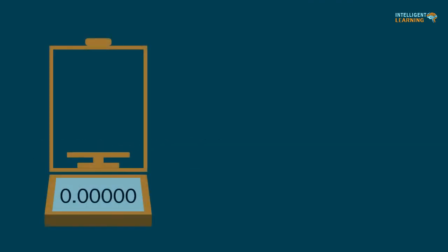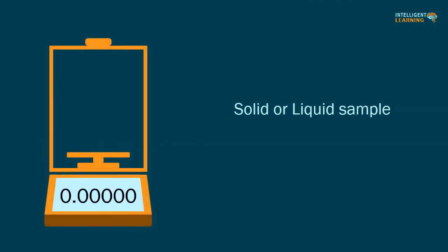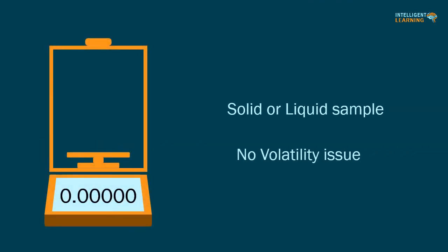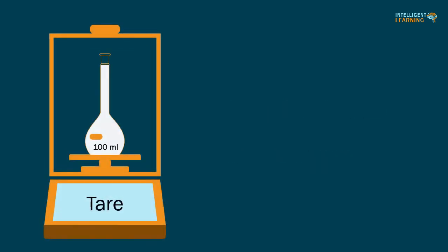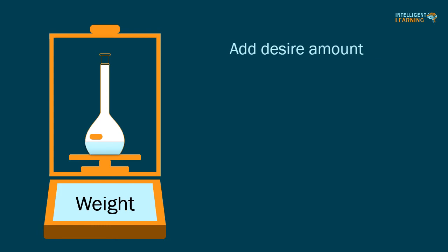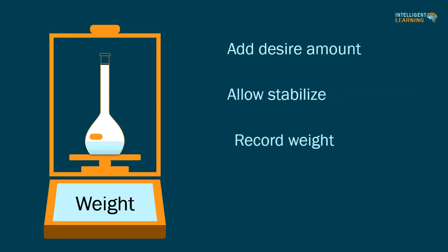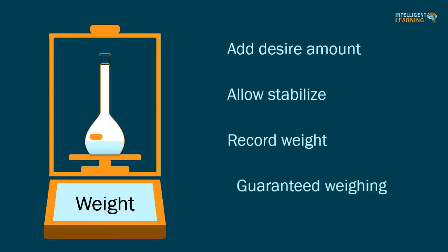Addition weighing is typically used for solid samples or liquid samples for which volatility is not an issue. The receiver is placed on the balance. After the balance display stabilizes, the analyst should tare the balance. Add the desired amount of material to the receiver, allow the display to stabilize, and record the weight.